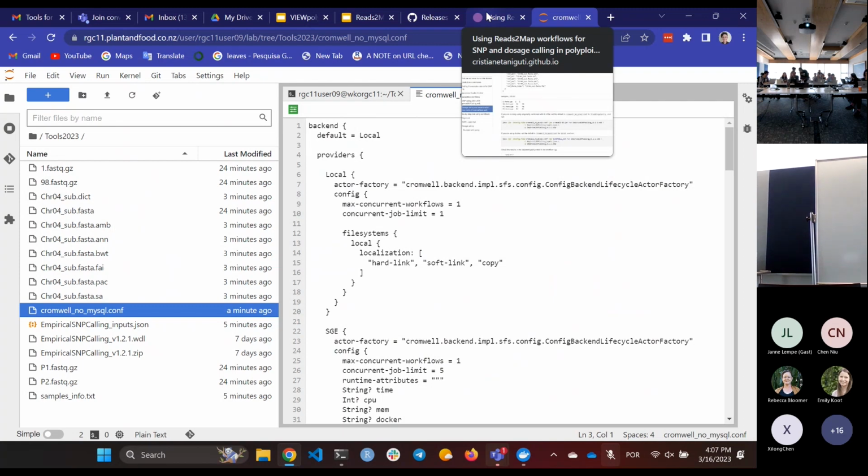When you have unsaved changes, the X up there on the file tab becomes a dot to show that it's unsaved. So once you save it, yeah, Control S. Good, I reopened it. And see, when you're changing there is a round circle, but when you save, then it's just a cross, which means it's saved. Yeah. So what she was doing to look at the files. Oh, just the old.